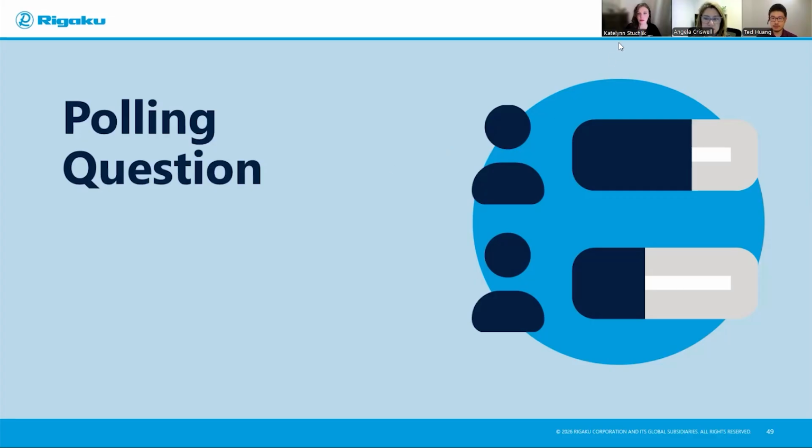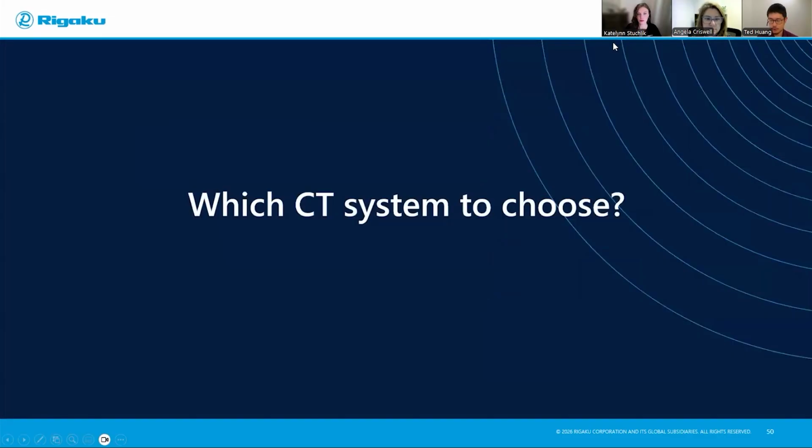which is, after knowing how to select your X-ray CT system, which system to choose, what are some of the things you need to take notice of, both in general using CT or when you're mostly dealing with smaller scale, high resolution, or the other end, maybe larger samples or more high density samples and so on. So let's talk about some practical strategies.